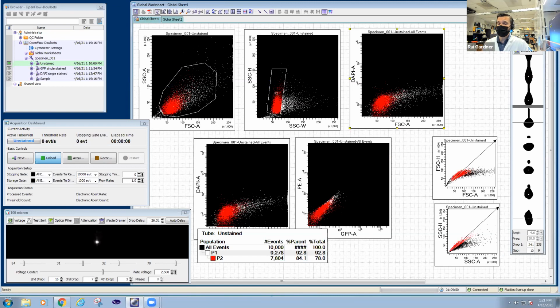Yeah, so that's a good point. And actually, we showed in previous sessions that we were using side scatter and forward scatter to narrow down the singlets, right? To help narrow down and just collect the singlets. Today, for just simplicity, we're using just the side scatter. If you ask me which one is better, I don't think there's one better than the other, and that's why some people use one or another, or use both, which is what we do.